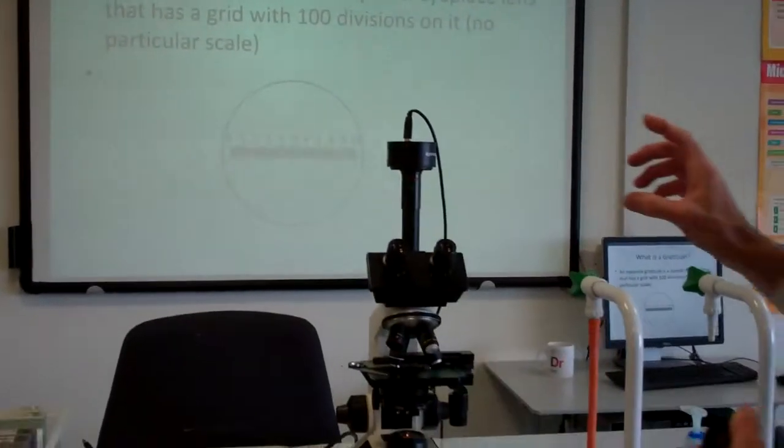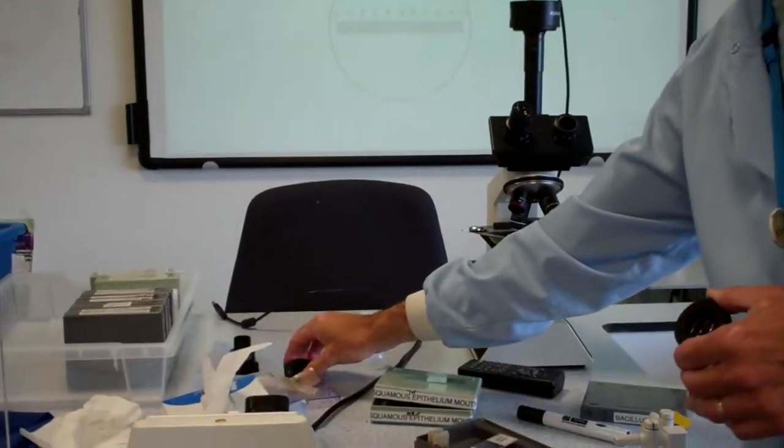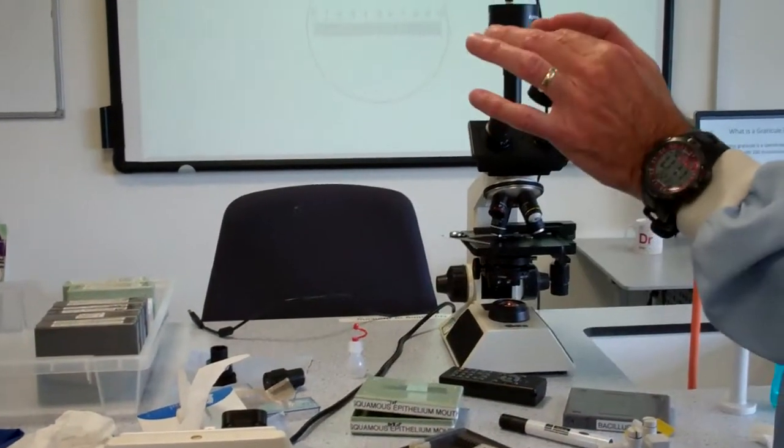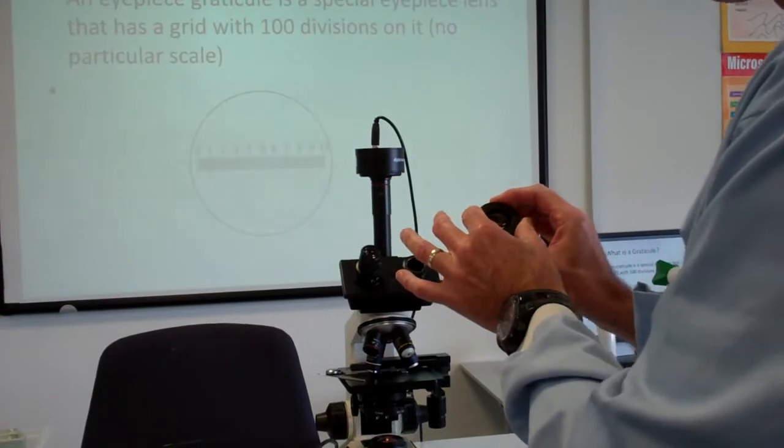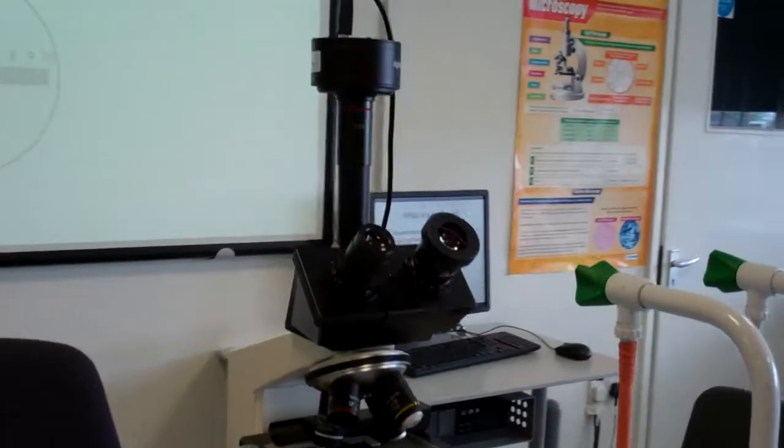Go to the microscope and carefully remove one of the eyepiece lenses. Put it down carefully. At the end of the lesson you need to put this back and replace it in the special place that's been provided for us.